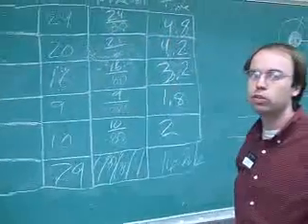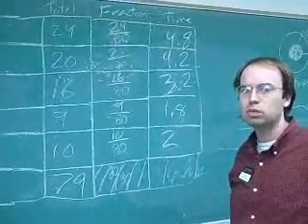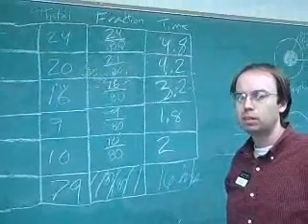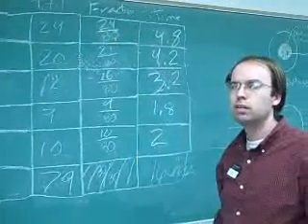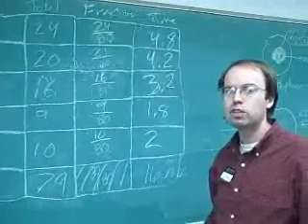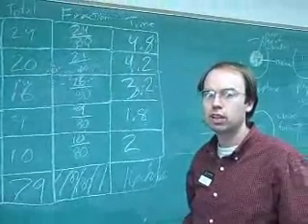And we multiplied our fractions by 16 hours, because 16 hours is the total length of time that mitosis takes place in allium. If you multiply the fraction of cells in any one particular phase by the total length of time the entire cell cycle lasts, you'll get an estimate of how long this phase lasts.